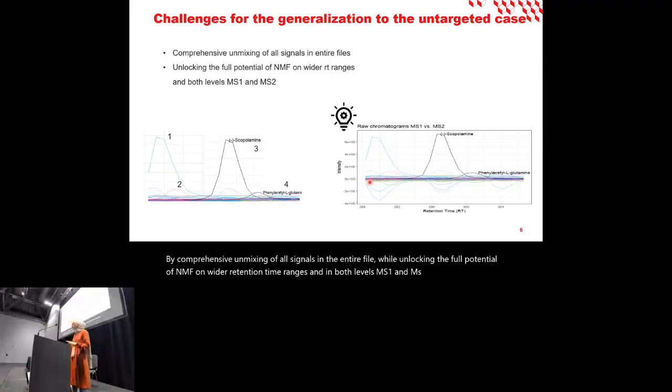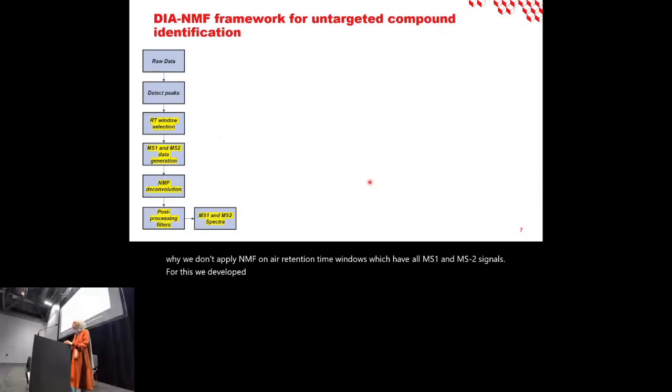For this, we thought, why don't we apply NMF on retention time windows, which have all MS1 and MS2 signals. For this, we developed our workflow, which is called DIA-NMF. It's a framework for untargeted compound identification.